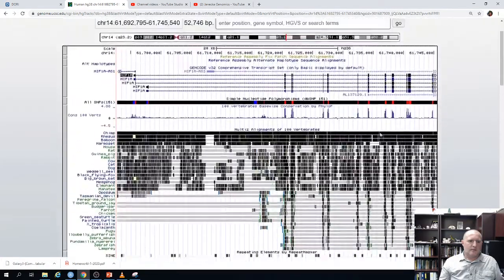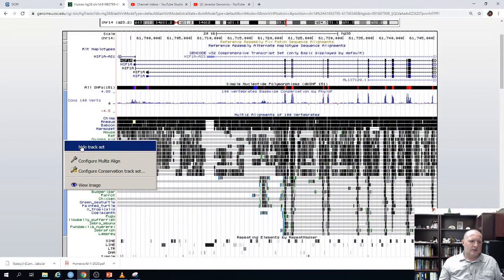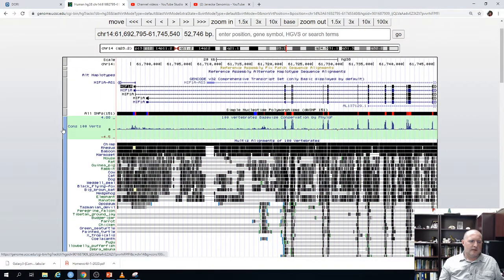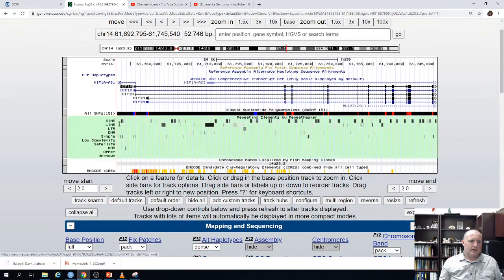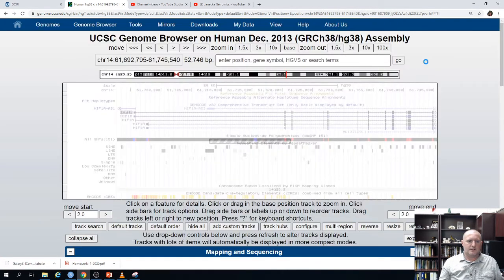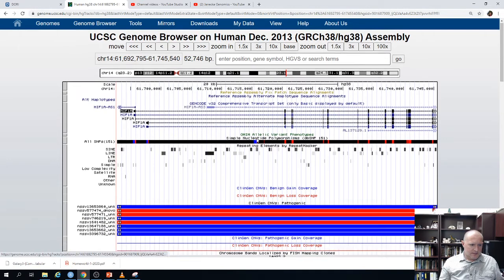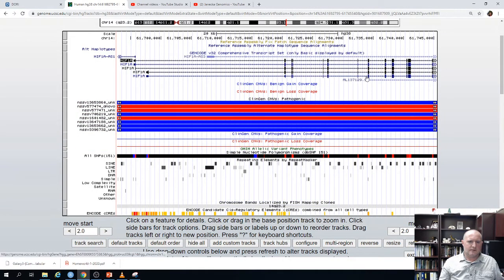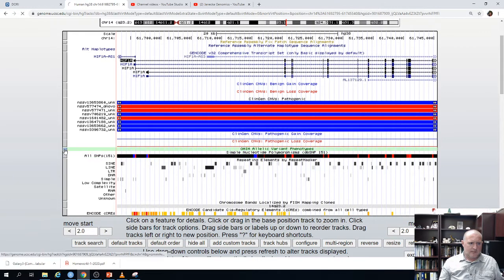Now let me point out that you can hide tracks, add tracks, collapse them, and move them around. For example, I'm going to hide the conservation track set and add clinical variants and clinical CNVs, then refresh. I'm going to grab the clinical variants track and move it so it's directly under the gene annotation track. I'll also do the same for my OMIM clinical variants.